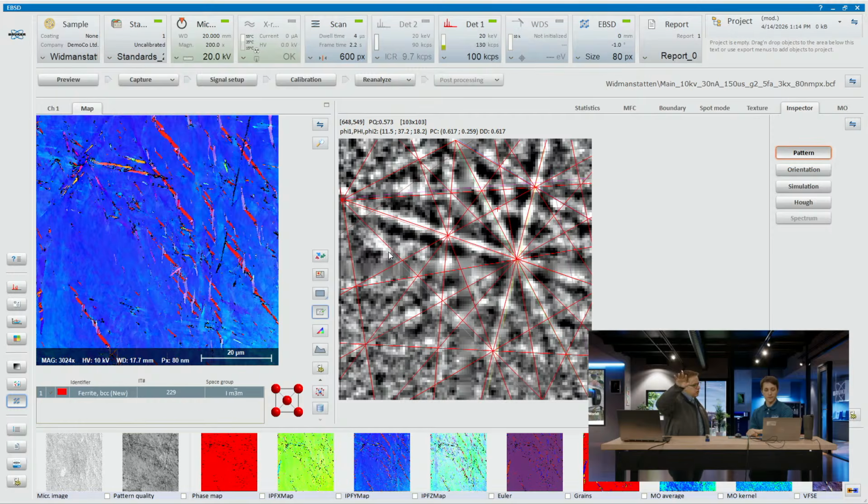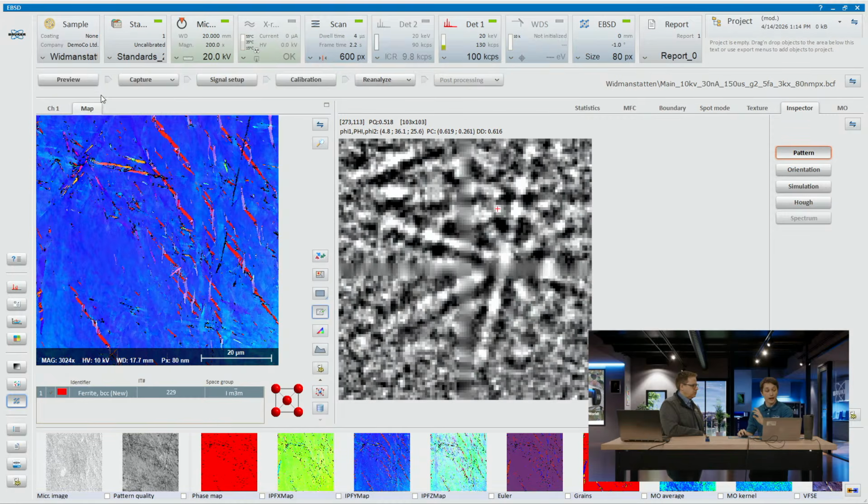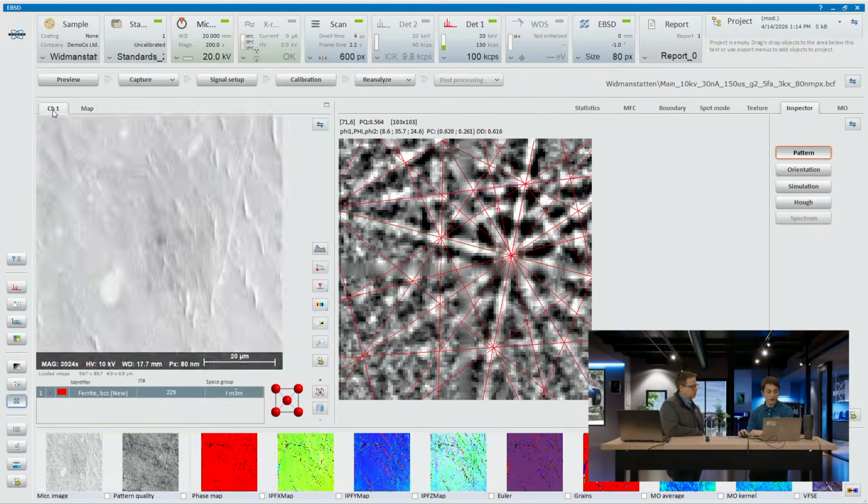And now the interface, the top part, looks similar. So we have all those microscope parameters. You have this kind of workflow. But then the bottom part has now transformed to be more EBSD-ish, right? And what are we looking at? So we have our different settings. We input a name for the sample. We can control the number of pixels that we're going to scan over. We have our EBSD tab here, so I can insert and retract my detector like that. I have my capture setting here, where I can capture this secondary electron image.